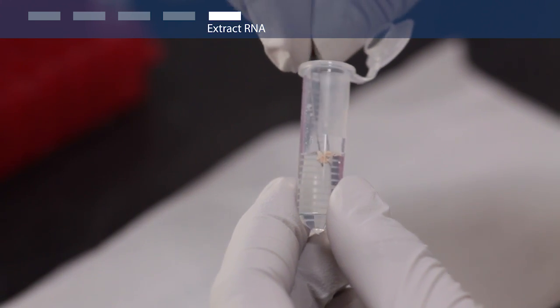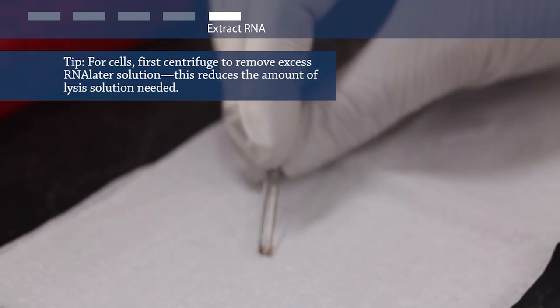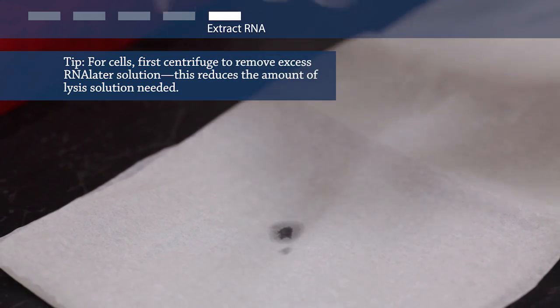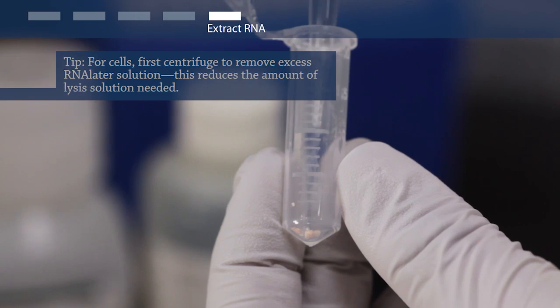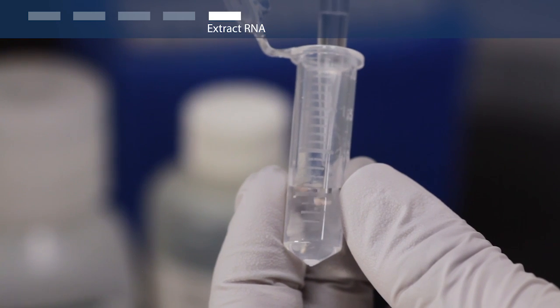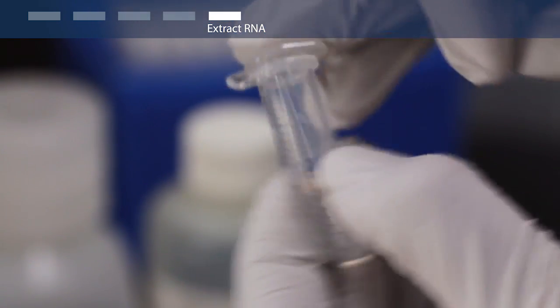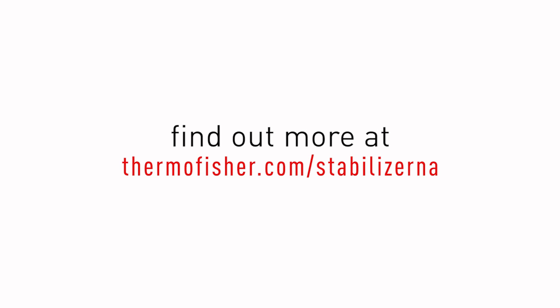When you are ready to process and analyze your samples, blot away excess RNA-Later Solution from your tissue sample with an absorbent lab wipe or paper towel. Then begin extracting the RNA by adding lysis buffer and homogenizing promptly. Your RNA is intact and ready for further processing.